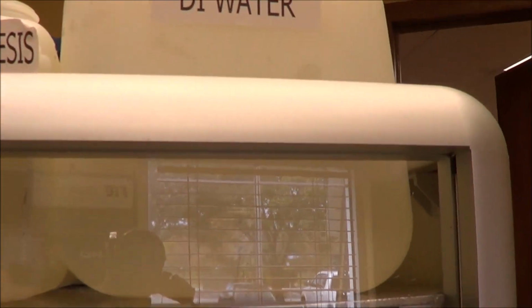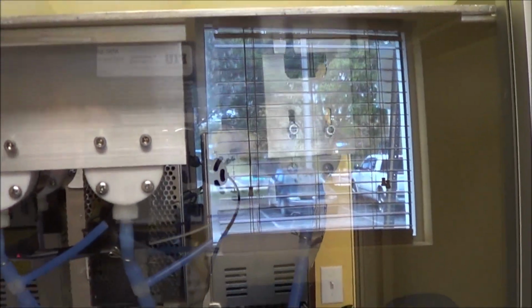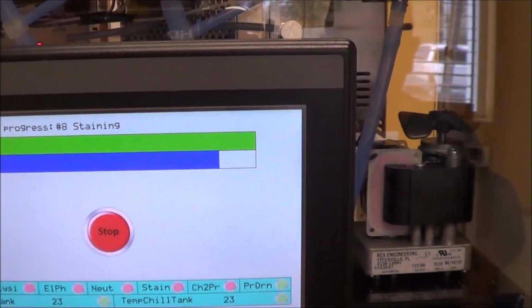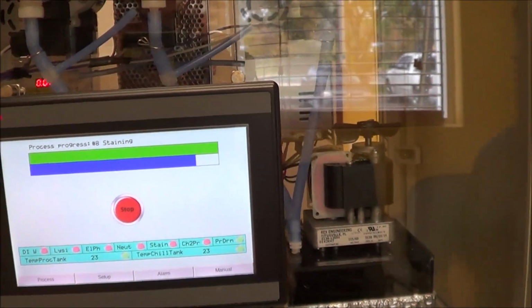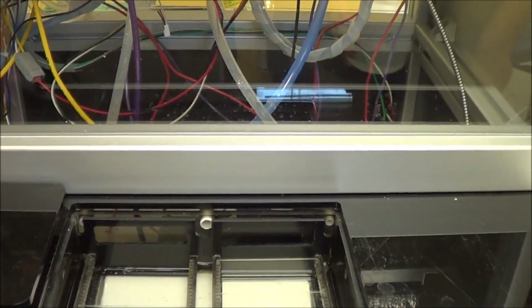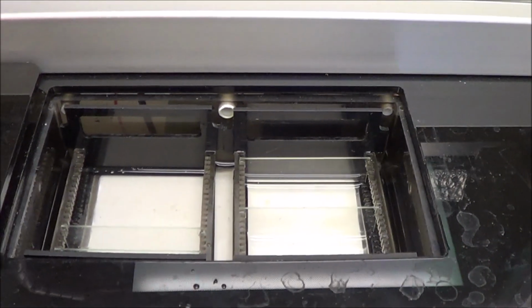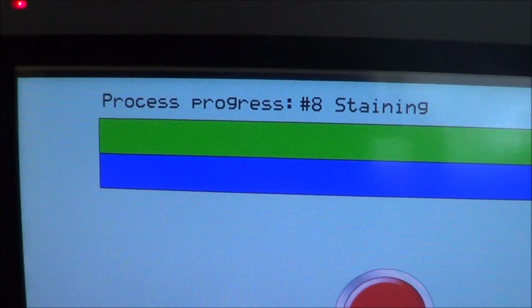Having to top off fluid, we started with less than a full tank of DI water. With the beaker. So, let's fill it manually. We ran out of DI water, so we're going to fill that. We're ready for the water wash. What is it? Oh, that's right. Yeah, I fill it up in the top. Oh, never mind. Little panic there. Yeah, I thought we were already on that step. Right. Full and ready to continue. Okay, yeah, cool. All right, excellent. Yeah, we're still emptying the stain. So we're at the end of the staining process.